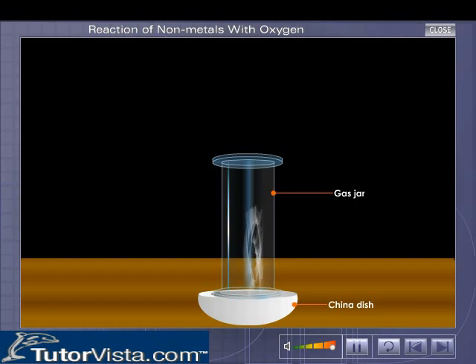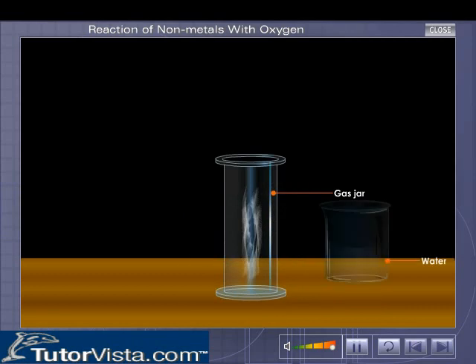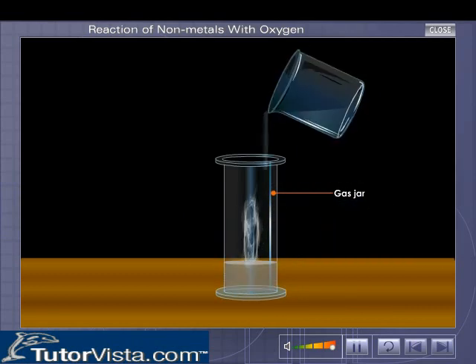You will observe that the gas jar gets filled with white fumes. Make the gas jar upright and pour some water into it and shake well.